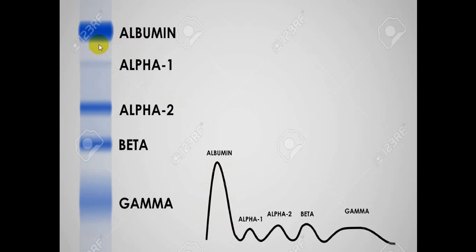So this is one sample that has been separated into 5 parts, and of these 5 parts you can't see the constituent well until you come to the peaks, or the figure here. This is a wave pattern.